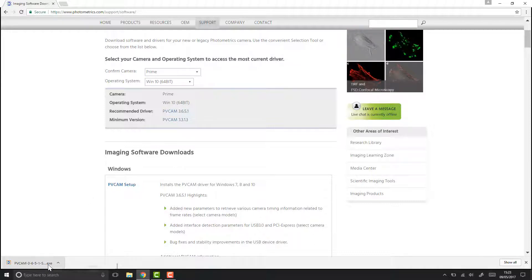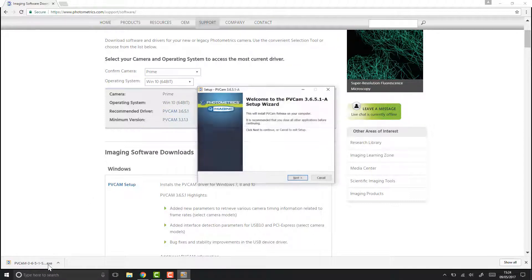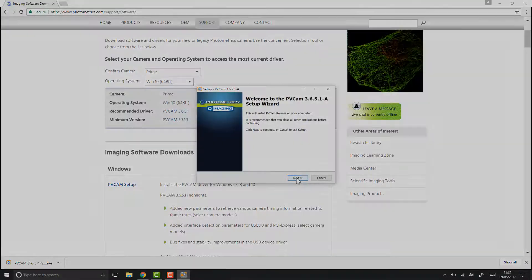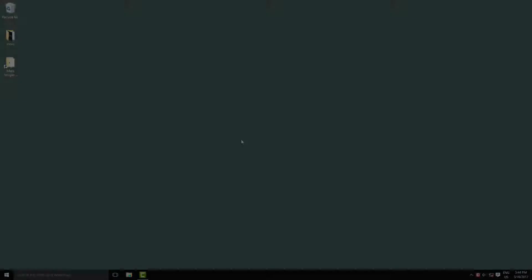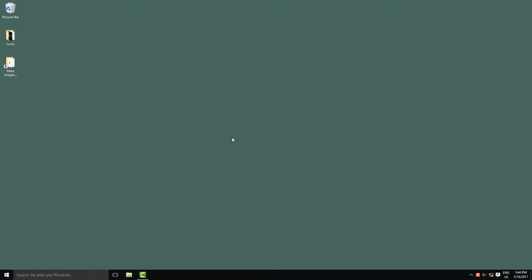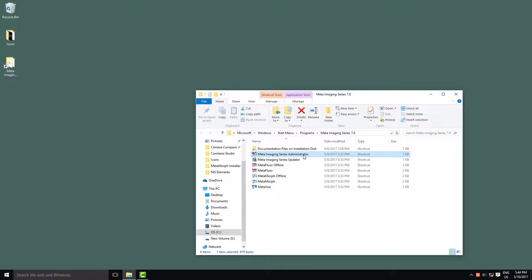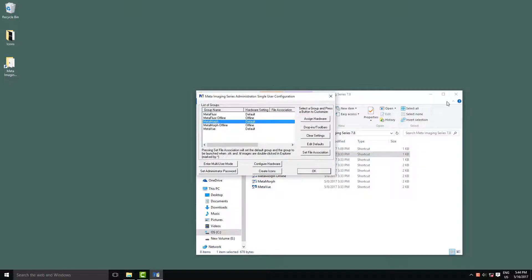You can then install this like you would any other software. Now we'll look at how to install the cameras into Metamorph. To start with, we're going to load up your Metamorph folder and then click on the Meta Imaging Series Administrator.